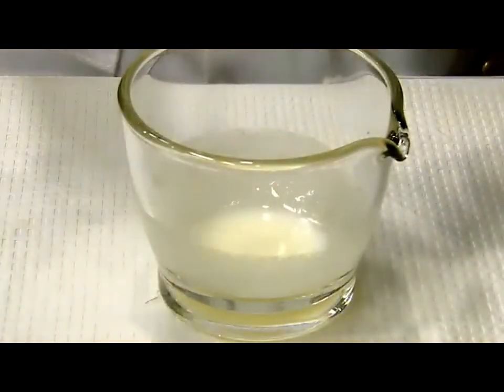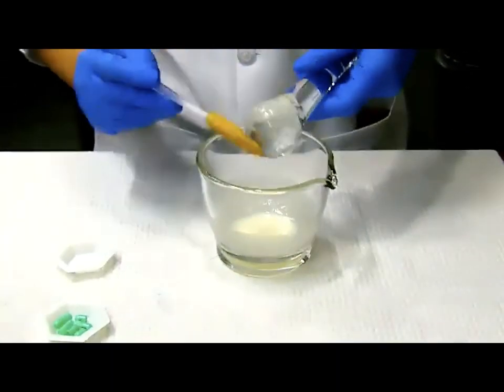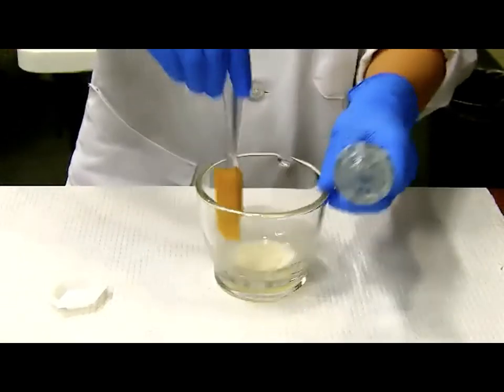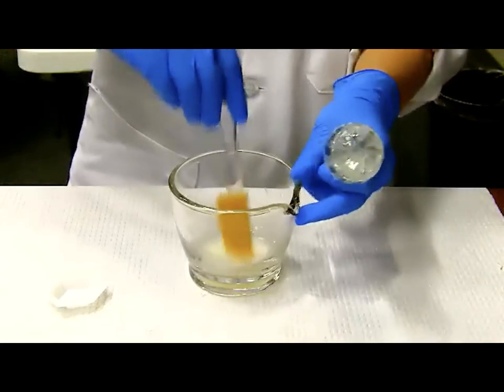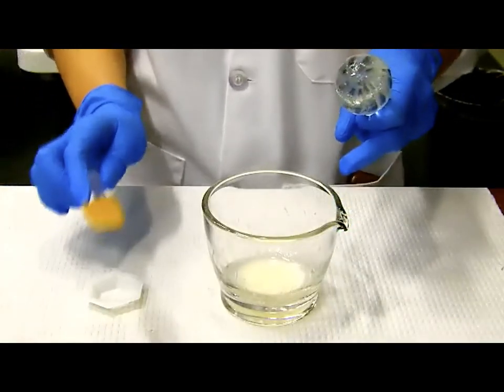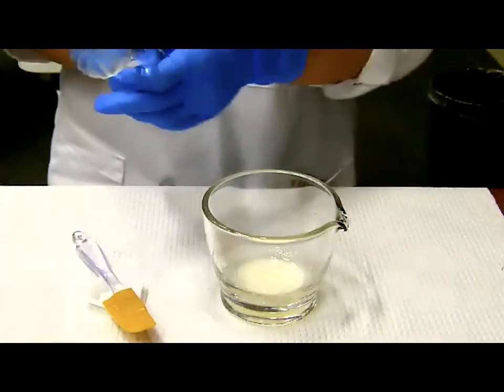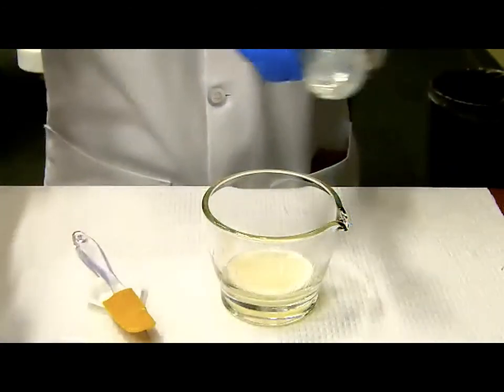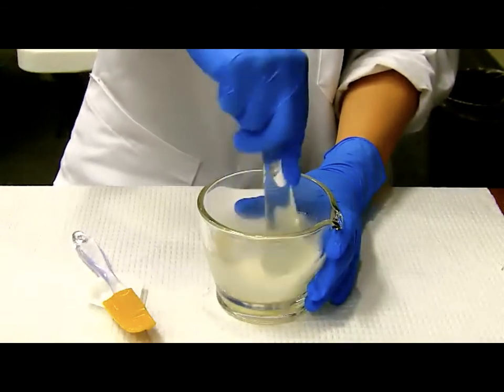Now is about the time I want to introduce my rubber spatula in here, so I can clean my pestle. I also want to gather as much onto the bottom of the mortar as well. I want to have as little as possible on the wall of my mortar. And pay attention, because your rubber spatula has drug on it, so you don't want to just lay it on the bench. Place it on top of a weigh boat. All right, here comes the third addition. Remember, it's geometric, so by the third addition, you're adding about twice the amount compared to the second addition.